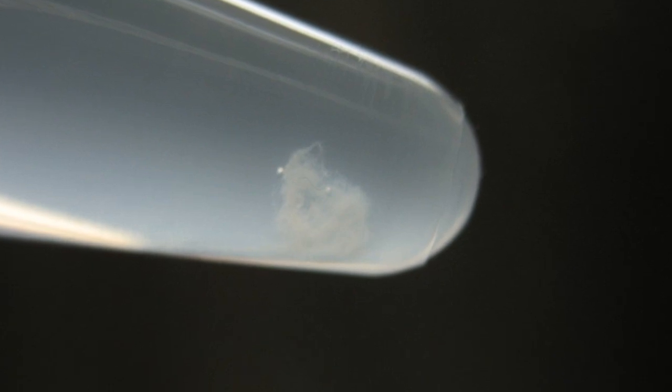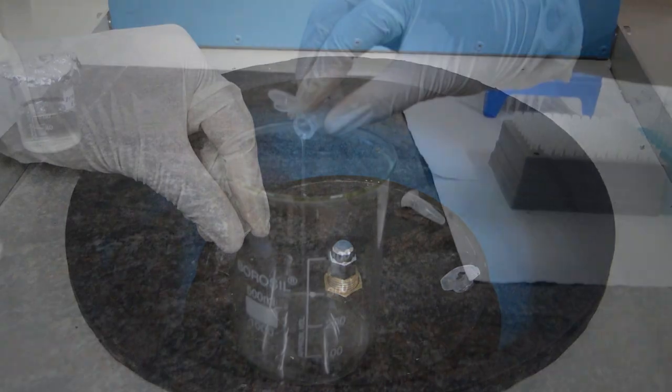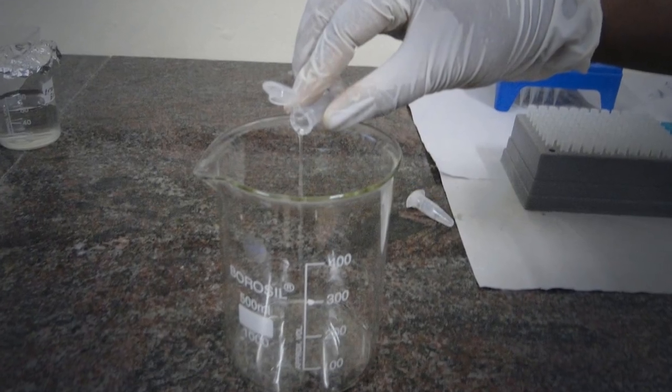Tap the tip of the vial. Now, the DNA strands will be visible when seen against light. Centrifuge it for 10 minutes at 10,000 RPM. Decant the ethanol or pour off the supernatant to get the pellet.